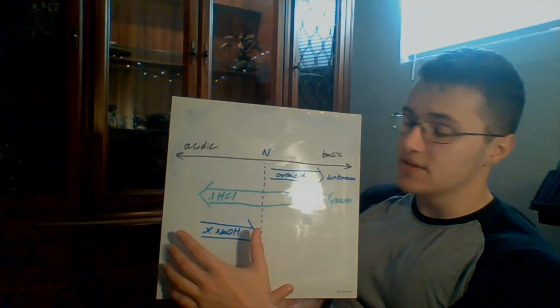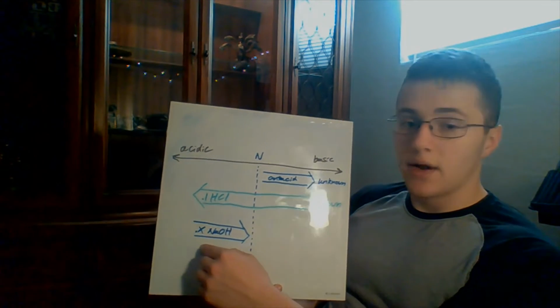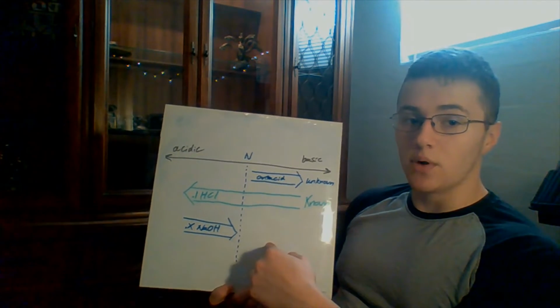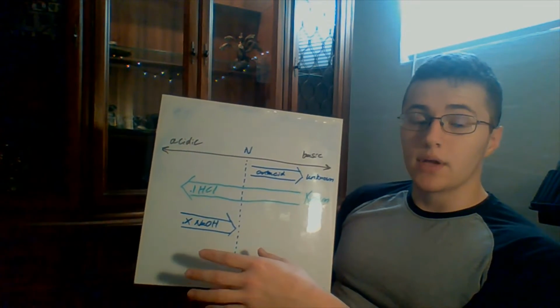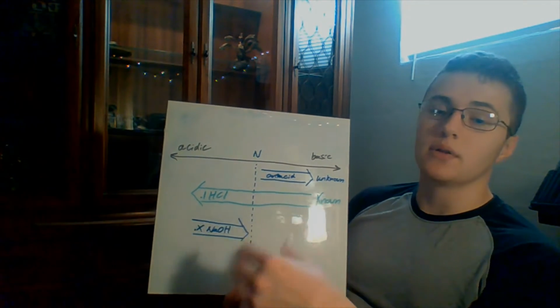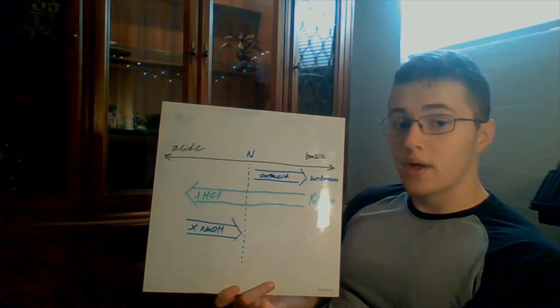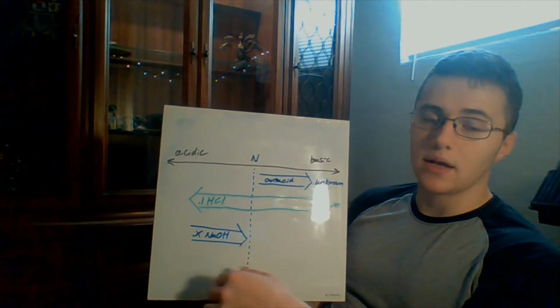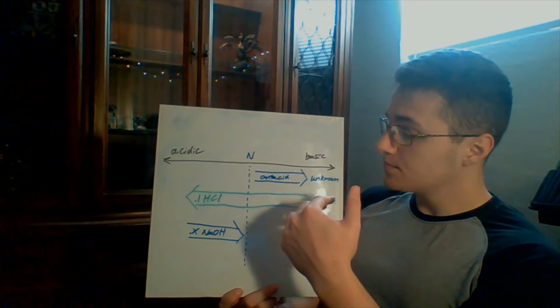When it is all the way in this acidic side, what we're going to see is a yellow color. As we start to add our NaOH, we're going to start going back to our neutral, which is our green, and then jump into our basic side, which is our blue. Still, what we're trying to do is track the volume that we're getting rid of, and from the first part, which I'm not going to spoil, what we were tracking was the true molarity of NaOH. You can go back through in that lab. I can give you some values to work with if you weren't there for it, so that you can figure out how to do that. And of course, you can always ask questions, and I'll help you through it.